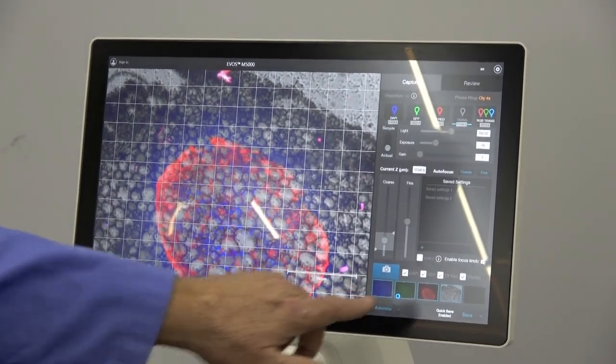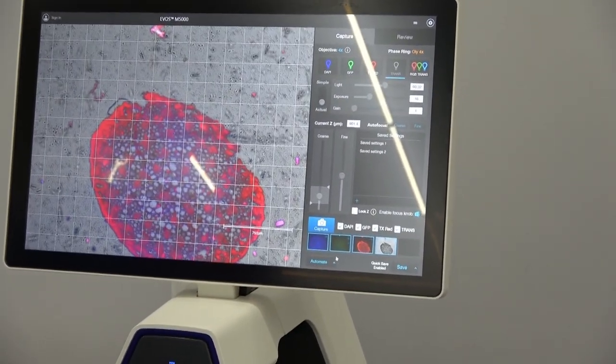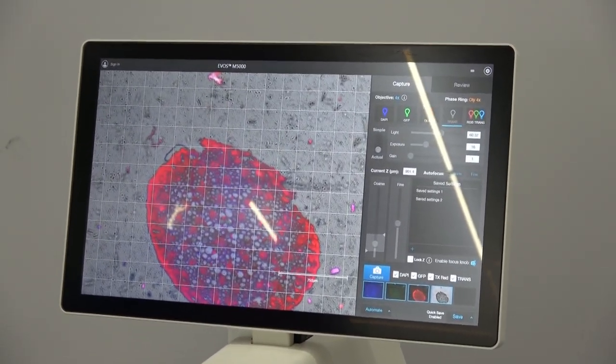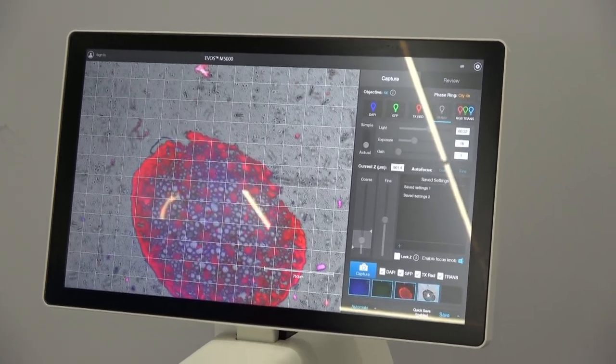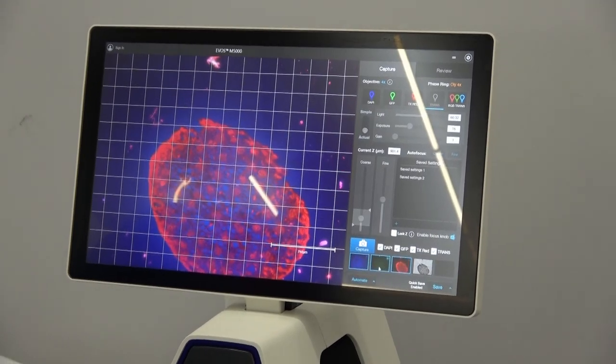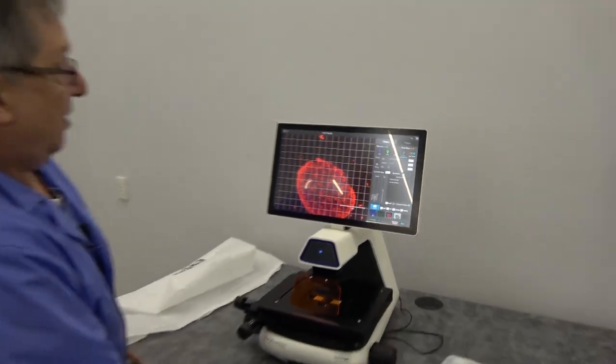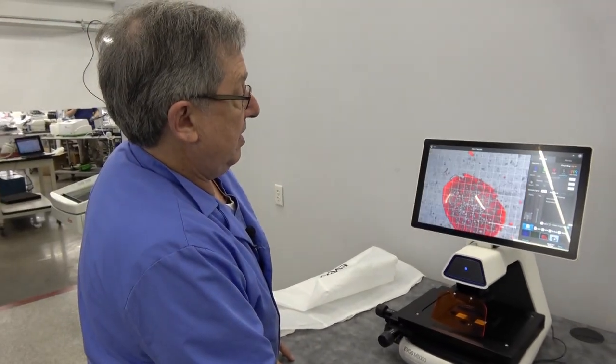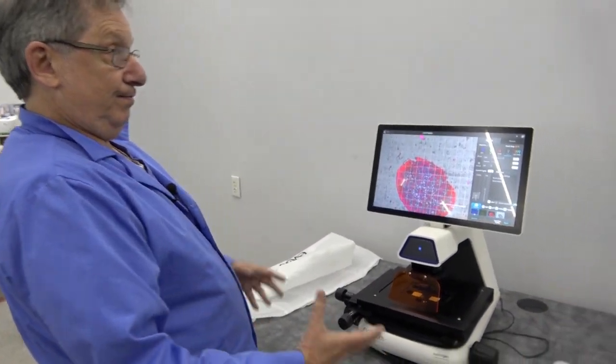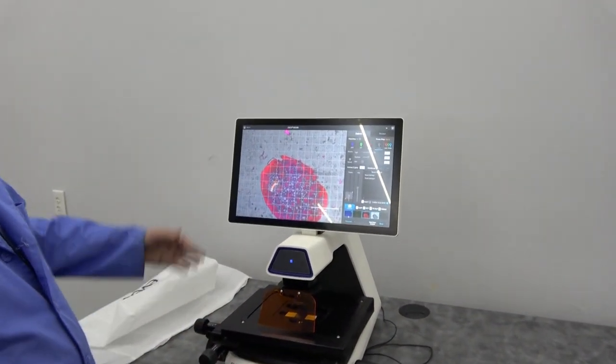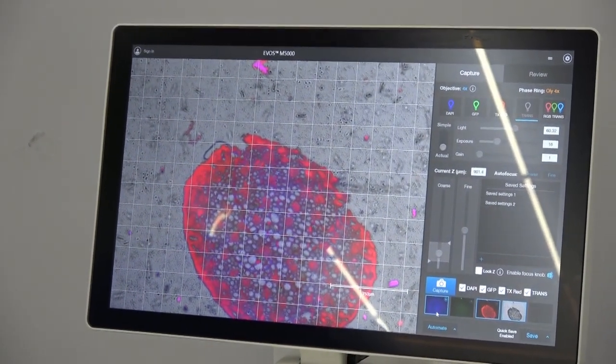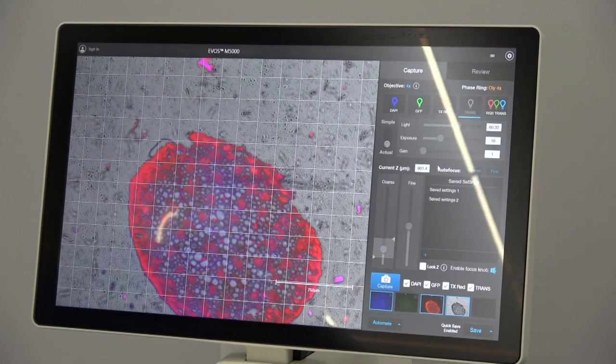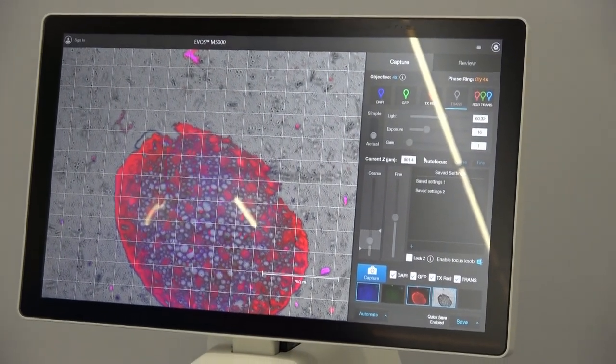We still have some of our other images down here, so it is showing multiples. And there we go. We got those different images and now we can turn on and off the difference to see what we've captured in four different color wavelengths. Very easy to change those over.